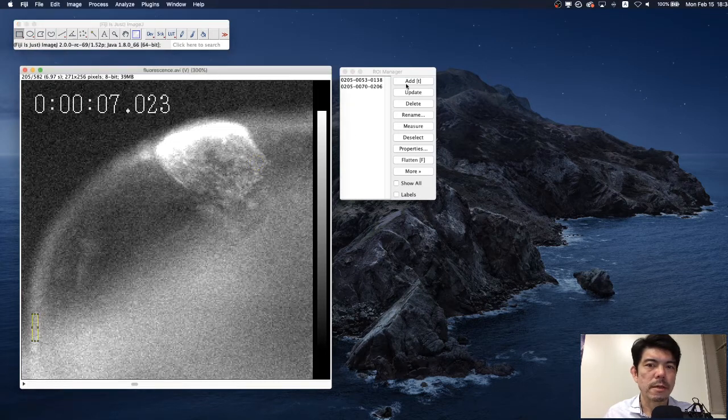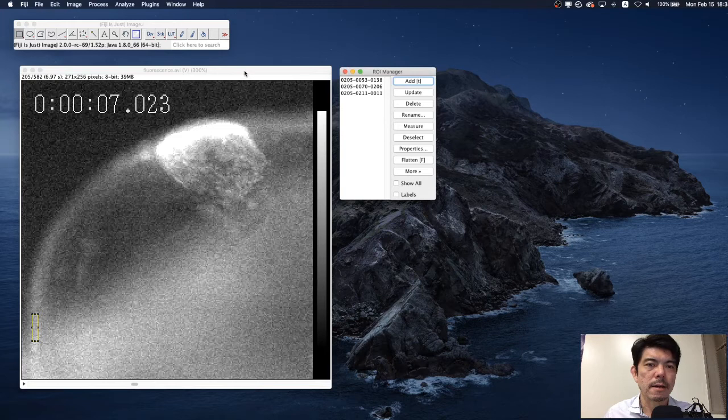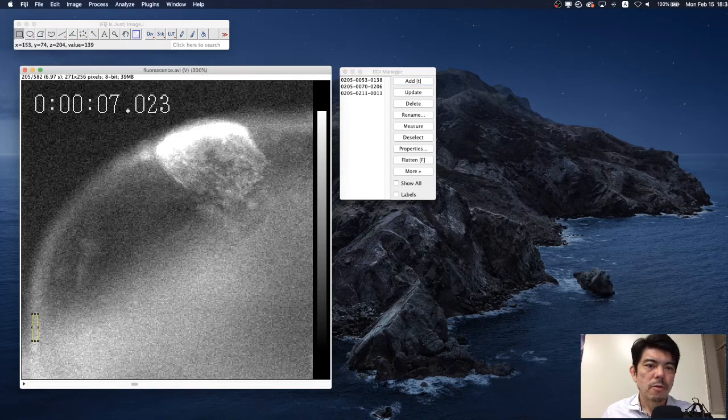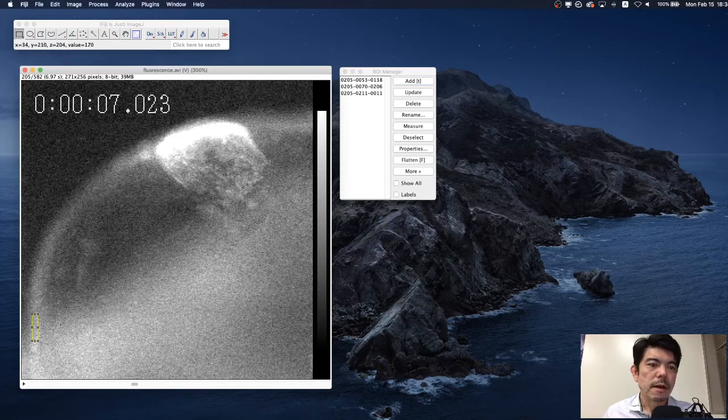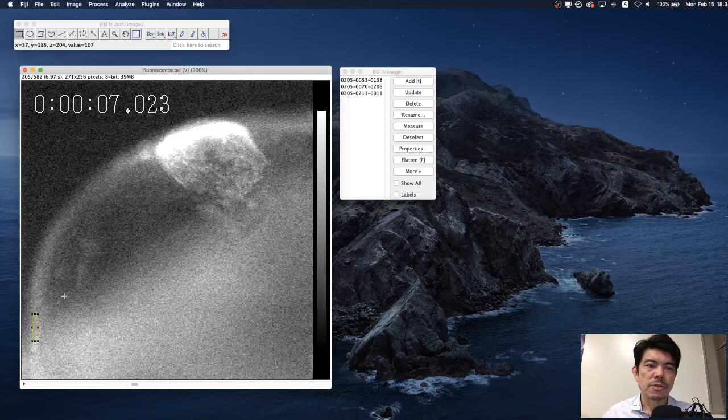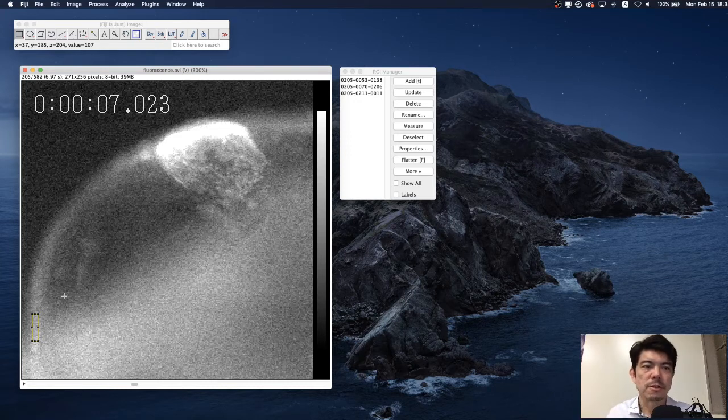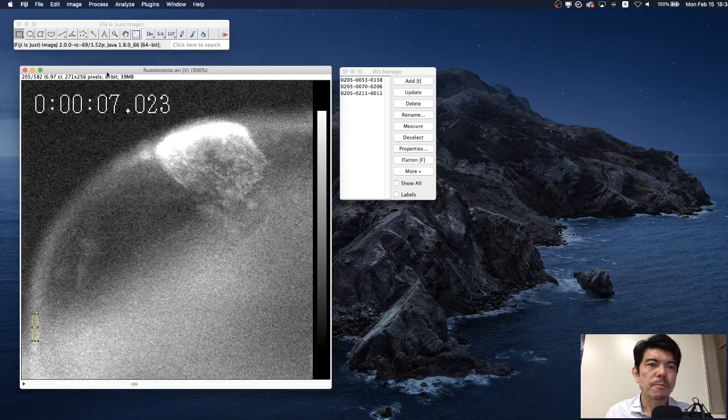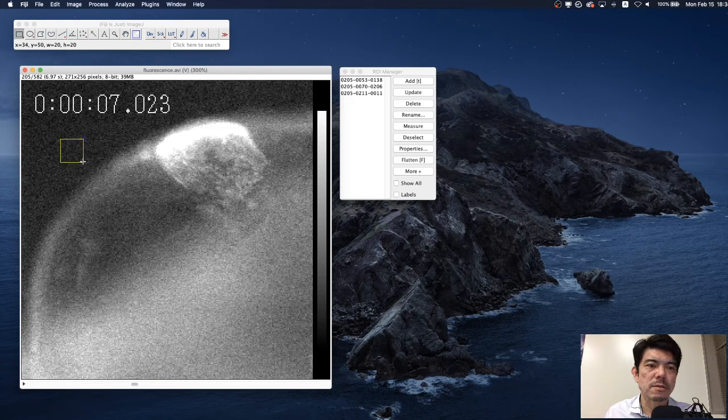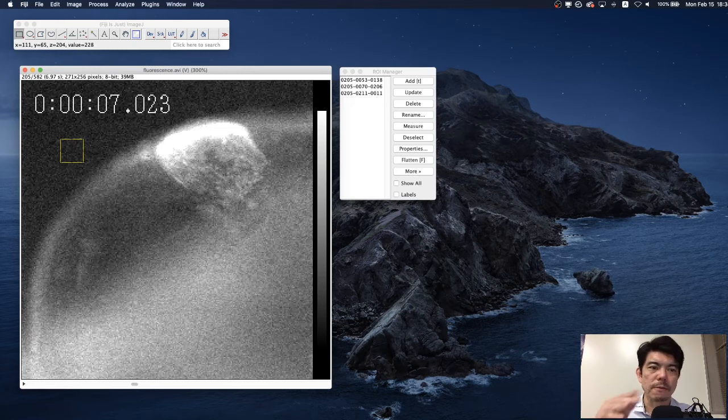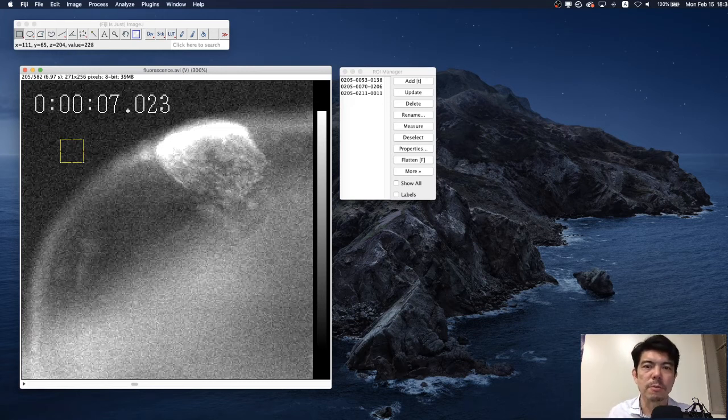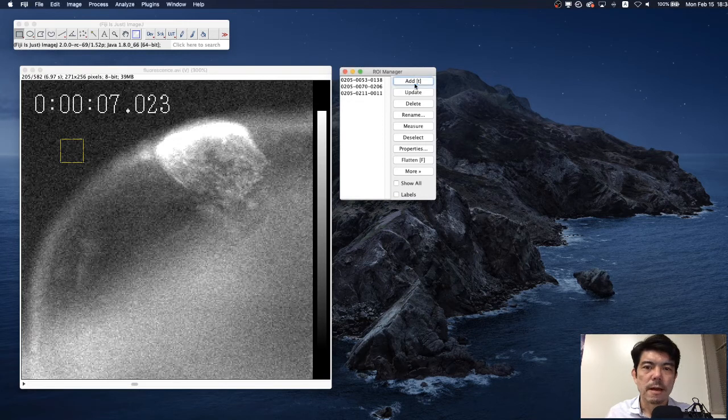And maybe we are also interested in here as well. We add ROI here. Because all these three ROIs are showing spontaneous fluctuation in the intracellular calcium level. Add ROI.